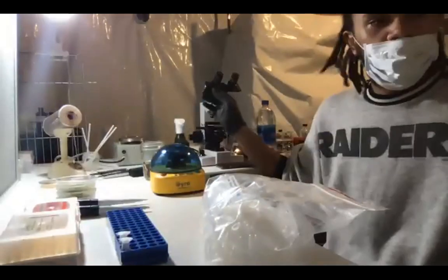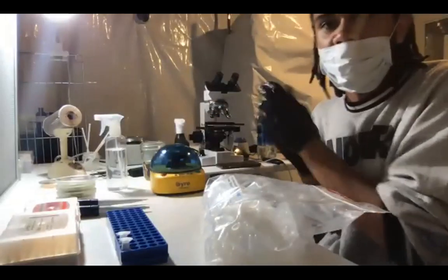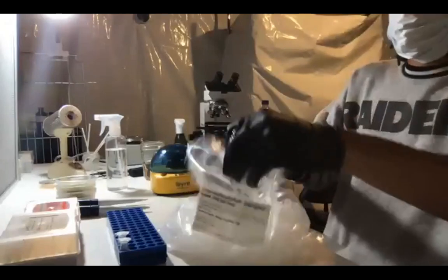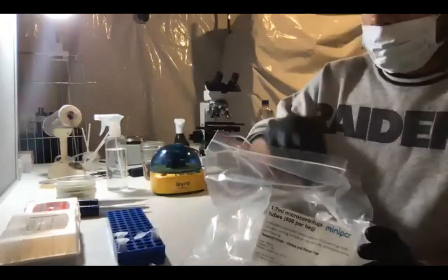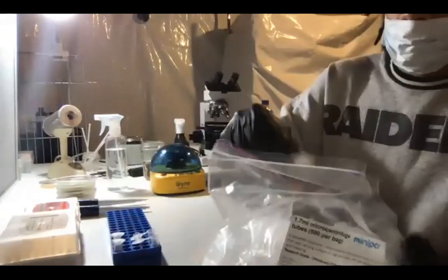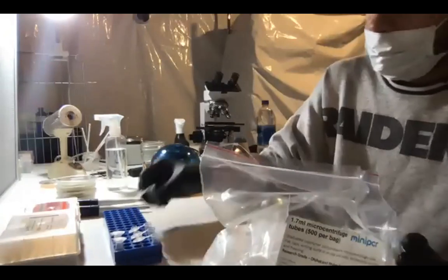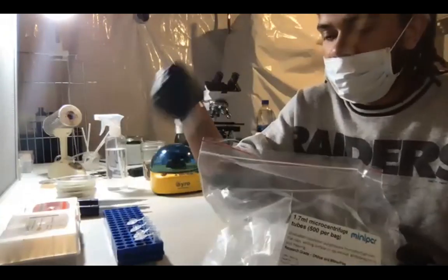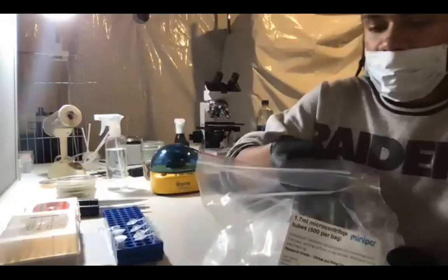So I'm going to go ahead and spray my hands down with some isopropyl alcohol. I have a bag of centrifuge tubes here that come sterilized, and you want to do your best to keep these clean. So I only open it in front of the flow hood and just take what I need. So I need 8 of these. I mean, I only need 4 of these, sorry. I need 4 of these for my samples. I need 2 of these to mix my primer, to dilute my primers. And I need 2 of them to make my primer mixes with master mix, which we'll talk about as we go.